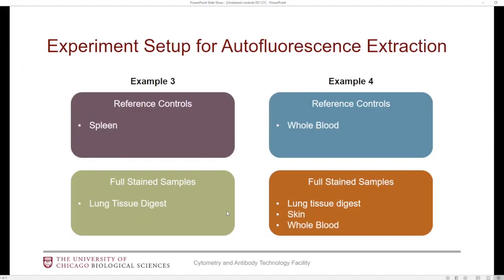Now for the autofluorescence extraction, you typically need to do these extra steps if you have situations like I've outlined — for example, different tissues. In example three, we have different tissues, so maybe spleen for reference controls and lung tissue digest for fully stained samples. In example four, you have one tissue for your reference control and two or more tissues for your fully stained samples. This is the situation in which you want to utilize the autofluorescence extraction feature. If you're not using this feature, you don't have to worry about setting up SpectroFlow this way.